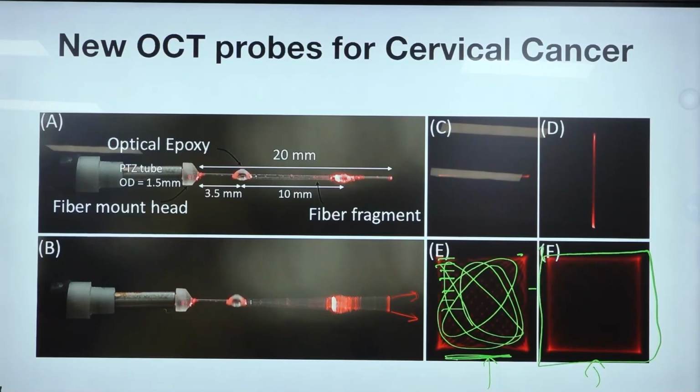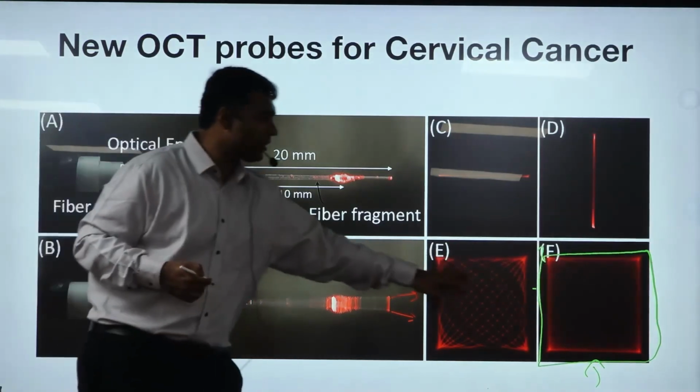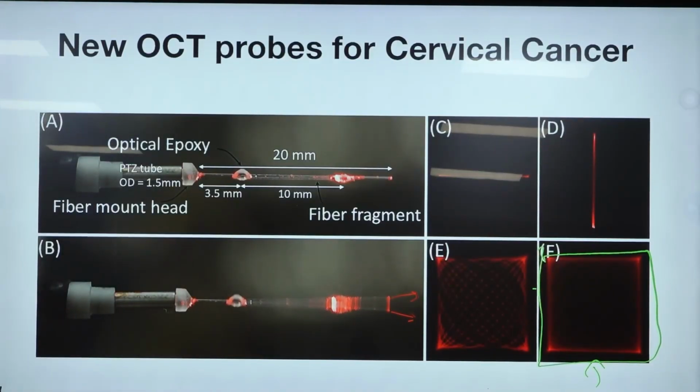The big advantage of doing it this way is that you can stop somewhere in between. If you are okay with there being some gaps, or if there are other methods to fill in the gaps, then you can do imaging much faster. You don't need to wait for the full image to be collected to get all the data.